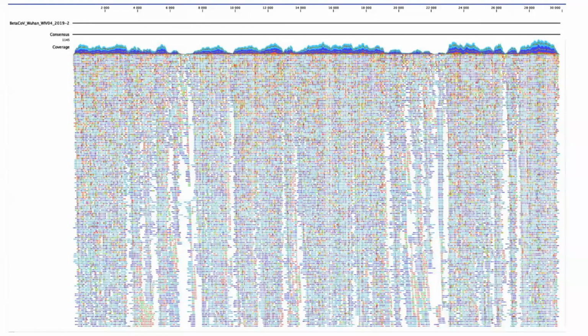In other words, if the sequence of reads all shows the exact same letters, they're going to be considered a consensus. If there's a disagreement between these, the majority is going to win. As a result, from a single isolate, we can get the full sequence of a viral genome that's going to be most abundant. This process is fairly accurate. However, it reduces the diversity of potential present variations of the virus in each sample to a single sequence. The more samples that are sequenced, the higher our confidence that the strain has a consistent characteristic.